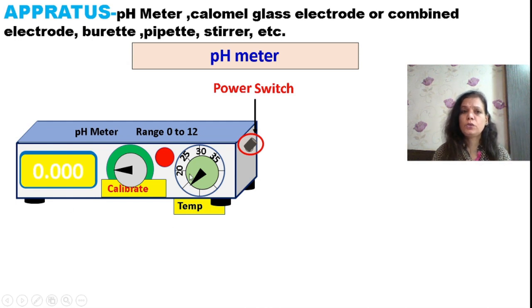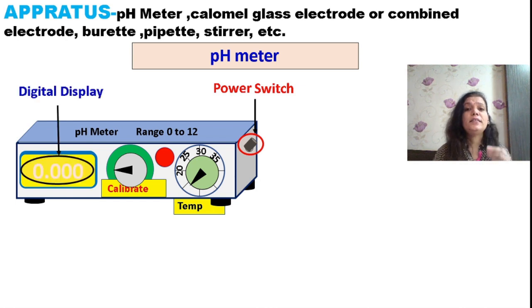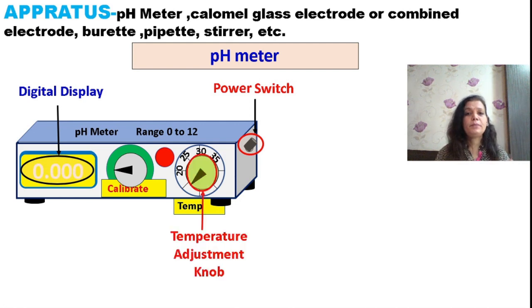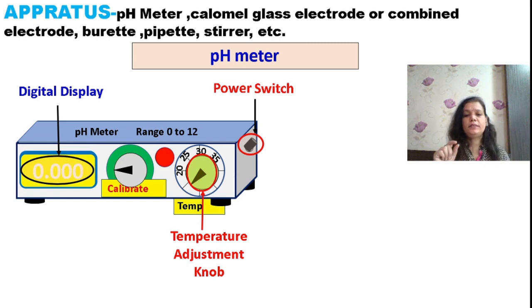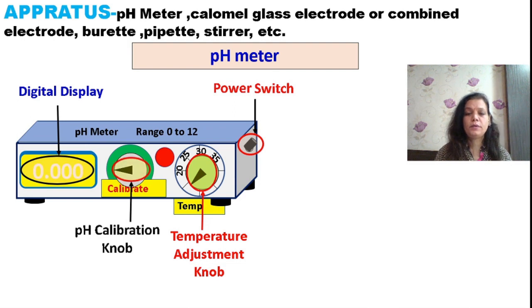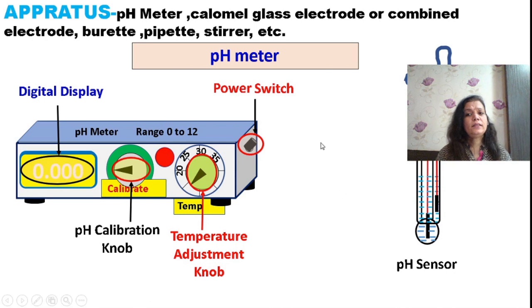Here is the pH meter shown in digital form. This is the power switch — you switch on the instrument, and a digital display shows the pH of the solution. There are two knobs: one is the temperature adjustment knob, where you set the room temperature, and the other is the calibration knob for pH.